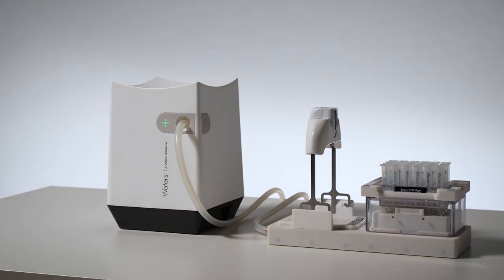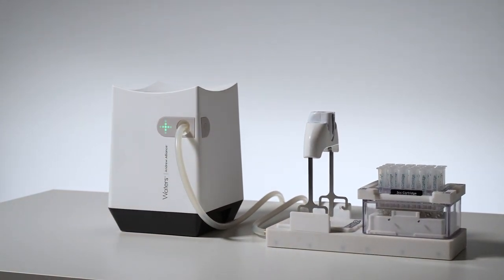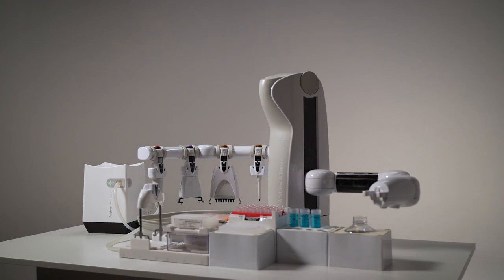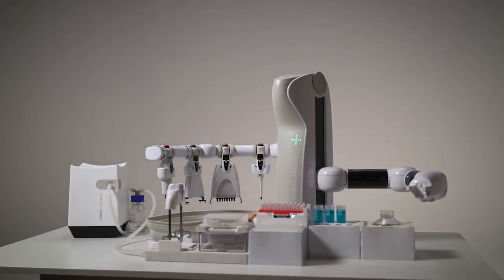The Extraction Plus device was designed to meet the needs of as many sample preparation methods adapted for negative pressure as possible. With that in mind, this device was built with a focus on versatility while also providing features that are indispensable for SPE workflows. Here's a quick look at the most important technical aspects.